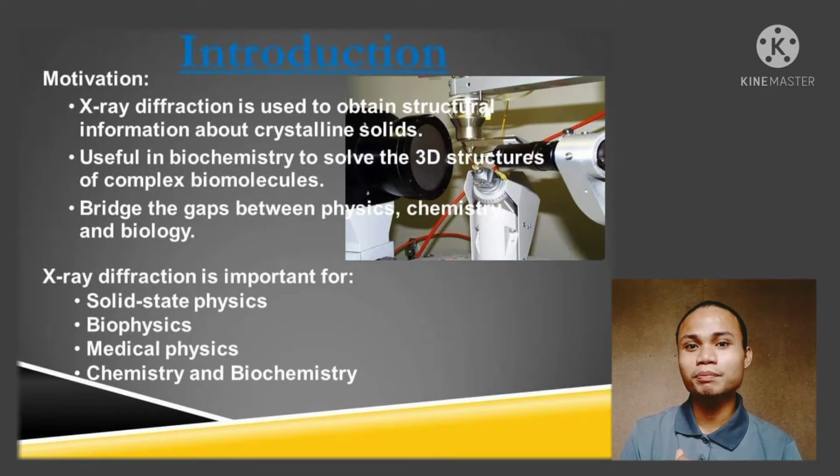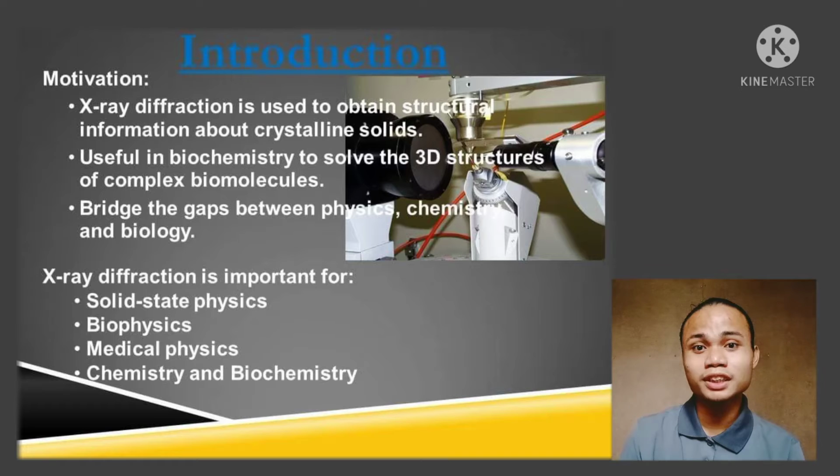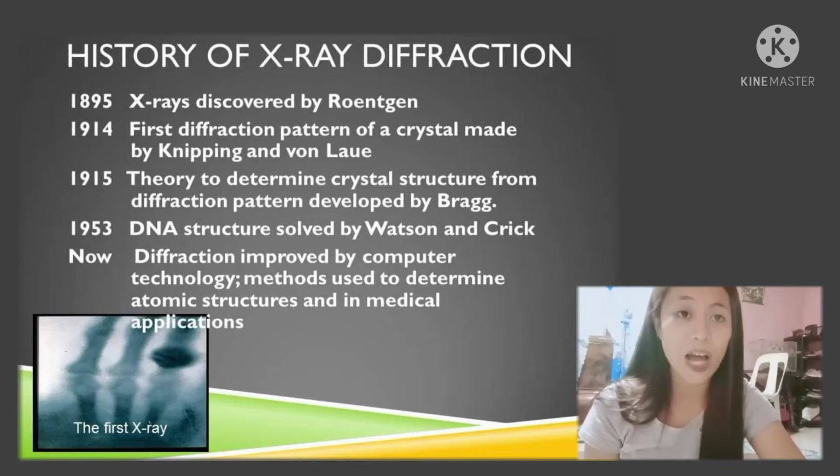Let us always remember that X-ray diffraction is very important, especially in the fields of solid-state physics, biophysics, medical physics, chemistry, and biochemistry. And now let's talk about the history of X-ray diffraction.